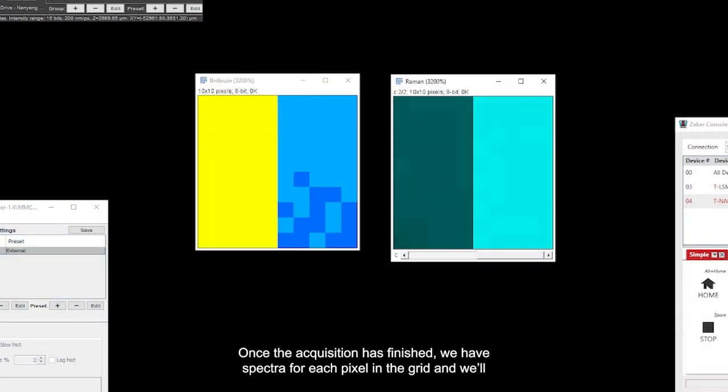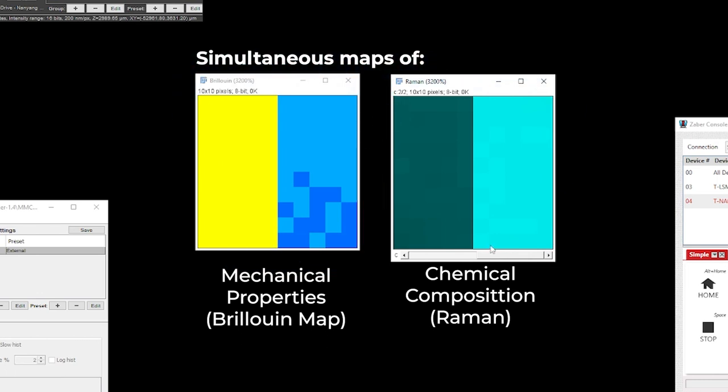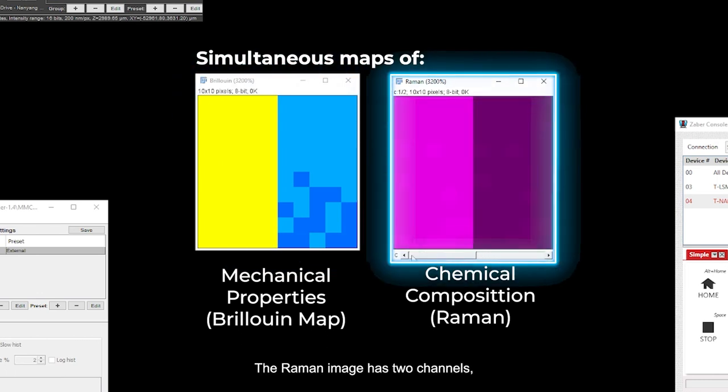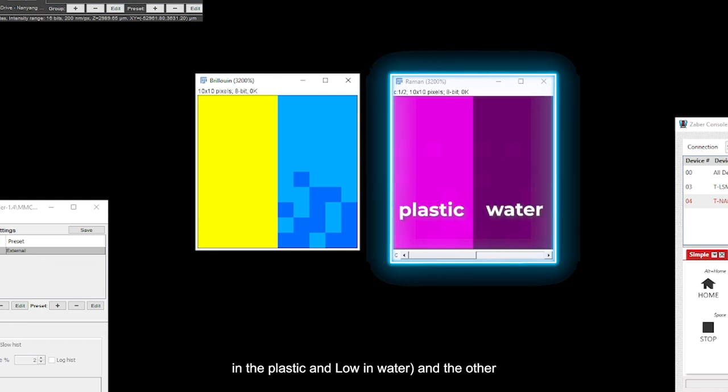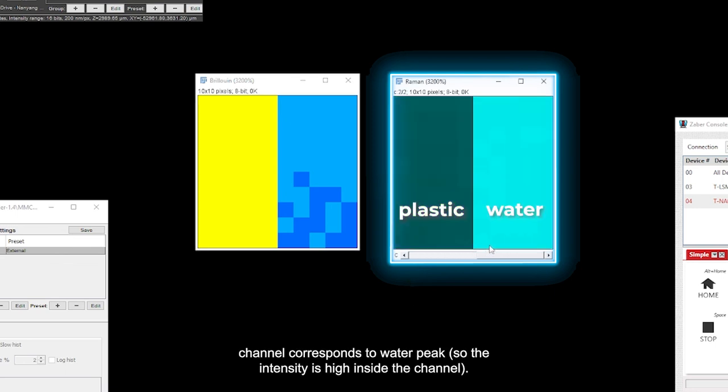Once the acquisition has finished, we have spectra for each pixel in the grid and will run a script to construct images from them, a Raman and Brillouin map. The Raman image has two channels, each corresponding to the integrated spectrum in different spectral bands. In this case, one channel corresponds to CH2 stretching vibration. It shows high intensity in the plastic and low in water. And the other channel corresponds to the water peak, so the intensity is high inside the channel.